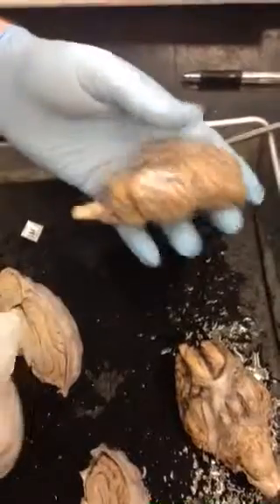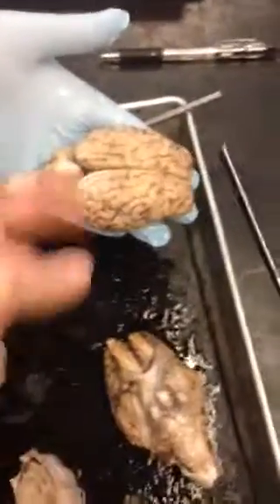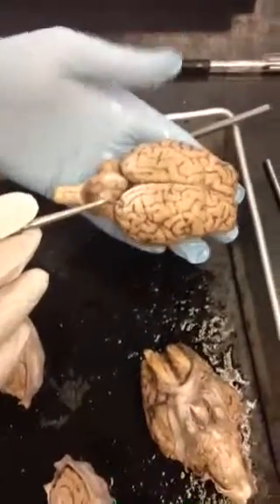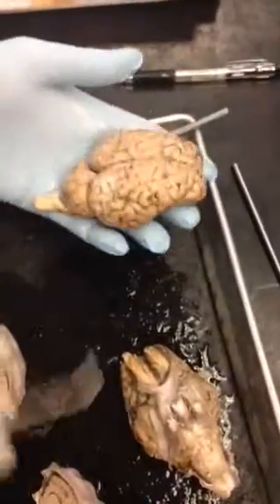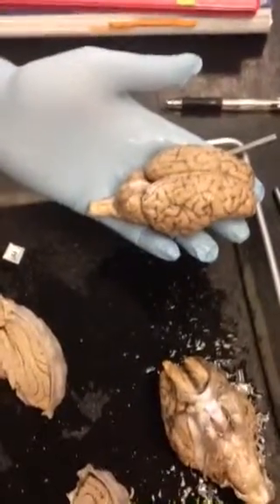Occipital, temporal, where are those? That's occipital. Not that, but the back. Yeah, that's occipital. And then the sides, the temporal. So it's kind of like the bones on the skull, right? Yeah. Parietal lobe, parietal bone, temporal lobe.